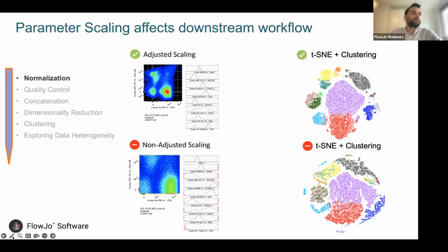But in that case, I would use cycombine. Since, as we mentioned before, you can use your concatenated sample to normalize with cycombine, I would downsample. You can take a portion of your cells and not your whole data set, merge those samples together, and then use cycombine for normalization.